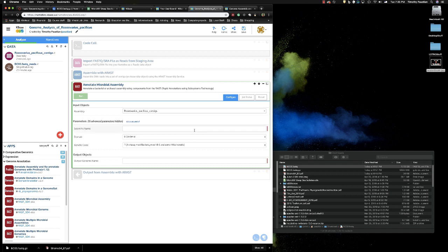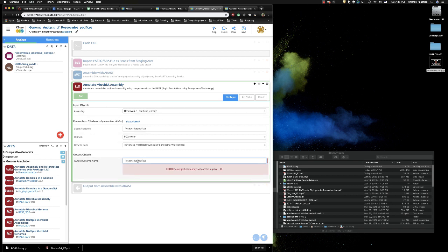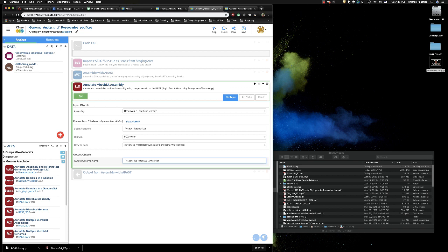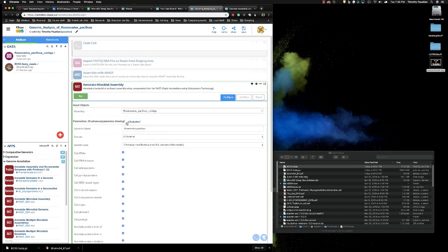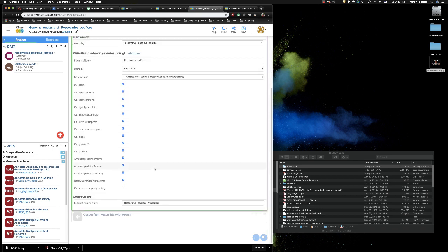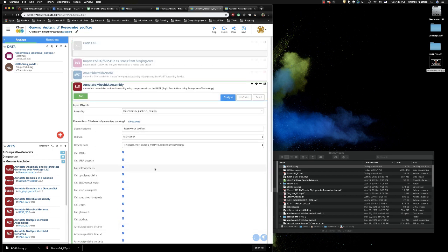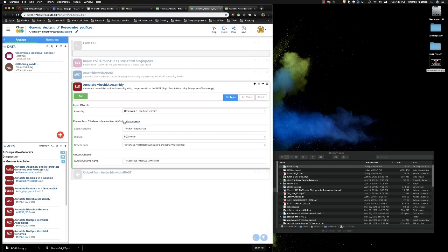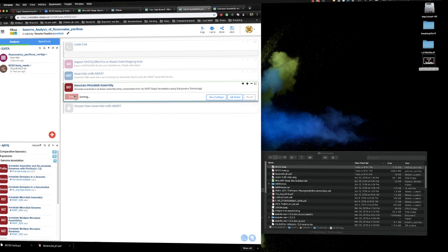It asks you what to assemble. Here's our Roseovarius, the scientific name. We can paste that in, Roseovarius pacificus. It's a bacteria. Output object. We're going to say Roseovarius pacificus again. And so again, you can't have spaces. And then we're going to say annotation. Okay, now we're ready to go. Again, there's advanced parameters. I would just leave all of this alone and just let it go ahead and call everything, right? So click run.